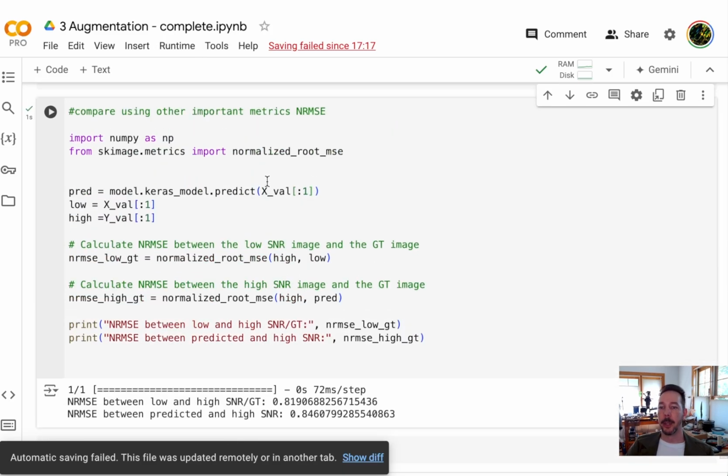Okay, and so with that, I'd like to wrap things up, and please feel free to reach out with any questions about using this in your work. I think CARE is a fantastic package to get started with for image restoration. And then in the next workshop, we'll focus on segmentation tools. So we're looking at how to create masks over cells, in both dense cells and sparse cells.